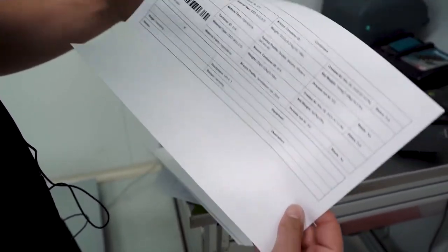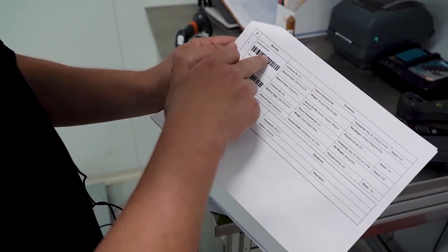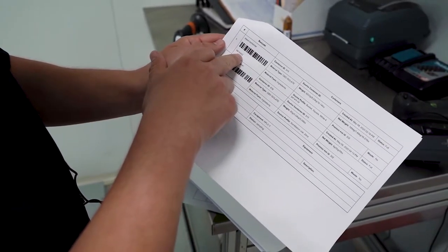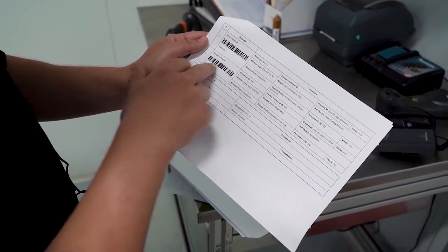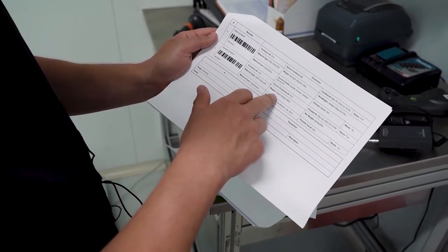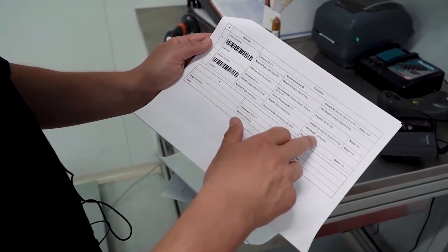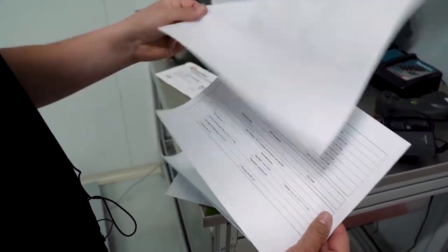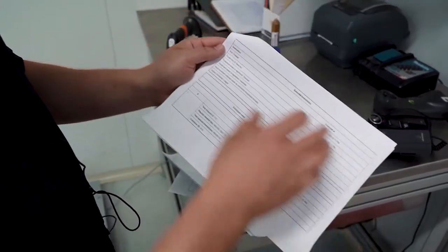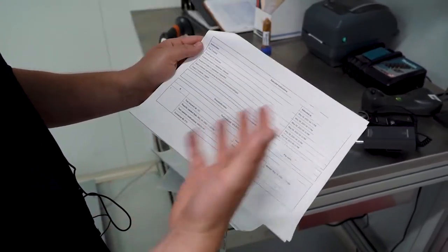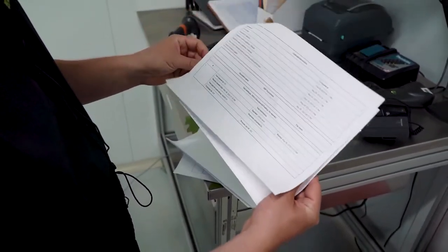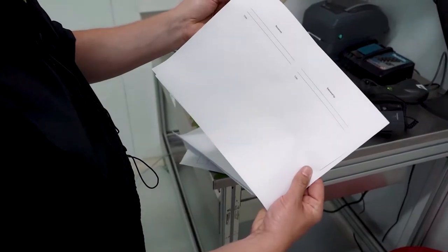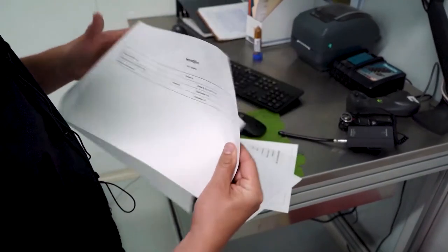So here we see there is a sampling event. It looks like the input container was this container ID. It was CBD isolate. They took a sample. Looks like they took a 4-gram sample that then was sent to the lab to be analyzed. And we have executed instructions, all with timestamps. So everything that is done is captured. And sign-offs if required.